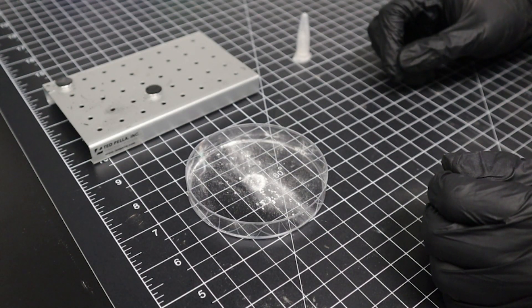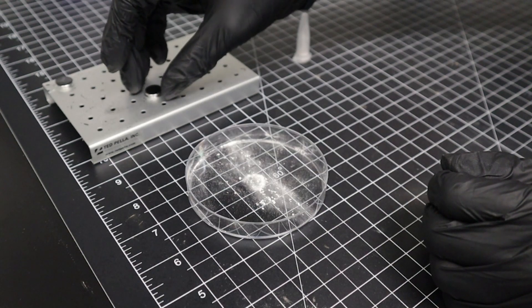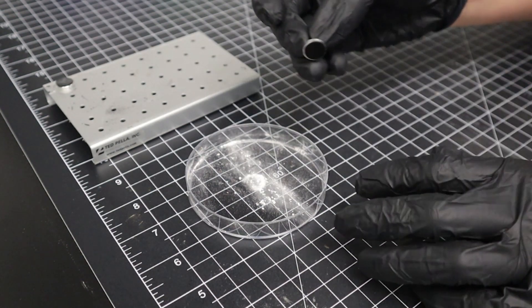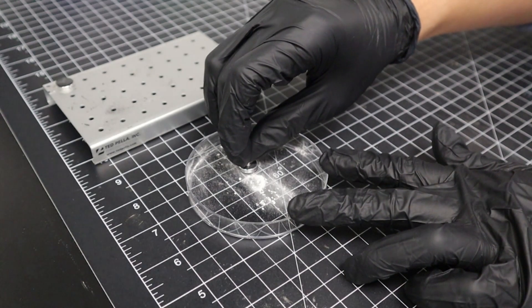We can then grab our aluminum stub with carbon tape and then lightly apply it to the dispersed powder. This ensures a nice even distribution of particles across the surface of the stub.